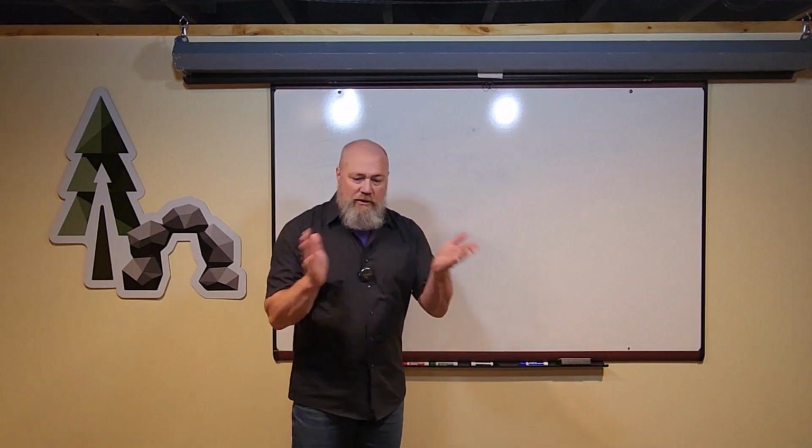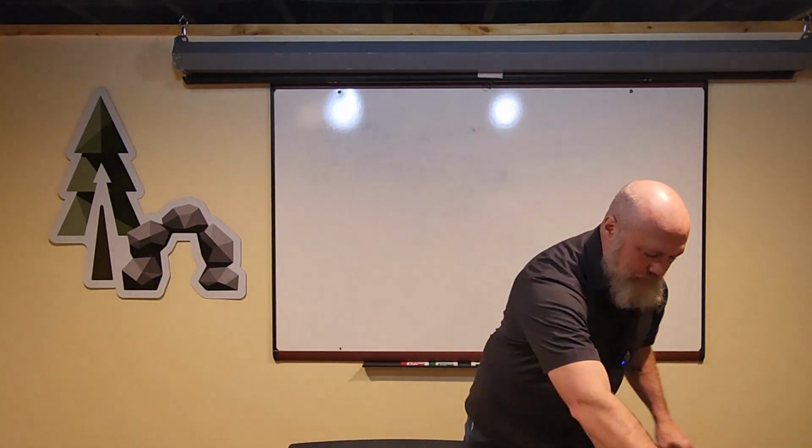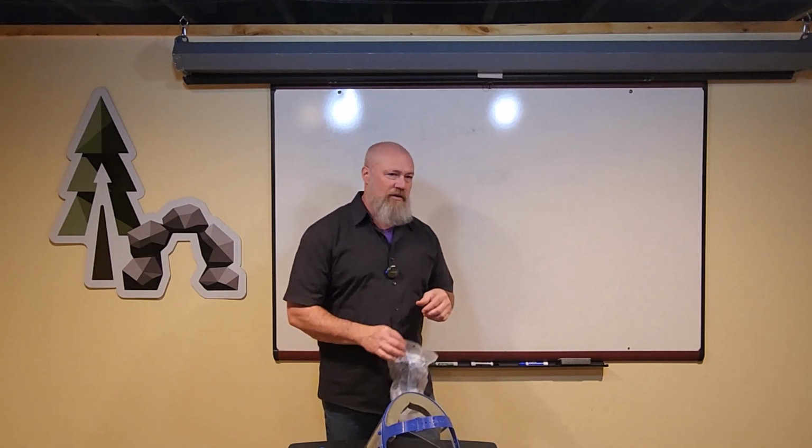First, let's talk about the tools you're going to use. I put a few out here. First thing is going to be safety, PPE, personal protective equipment. If you were to take a course of mine at the local university, in the cadaver lab, you will be required to wear a 3/4 length lab coat. It has to go below the waist, not just a white jacket, and closed-toed shoes, preferably made of leather or nylon.